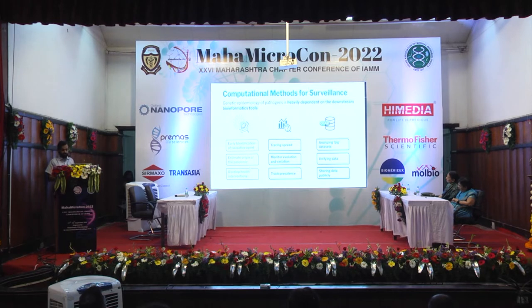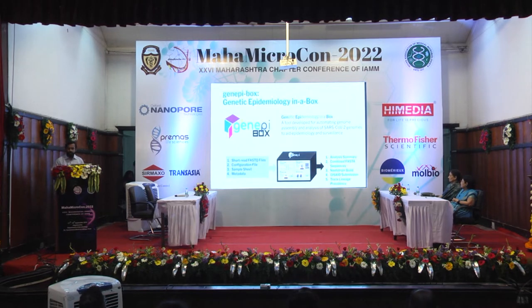But of course, much more important to analyze this further is to be able to share this data so that the public and learned people in the public could actually analyze and make quite favorable interpretations. And to enable this, of course, you need to have computational tools. And this is one of the automated computational tools that was being developed in the lab, where you could use this computational approach or a box where you could use any next generation sequencing data for any viral outbreaks and be able to analyze without having to go to the nuts and bolts of bioinformatics. This is freely available. It can take a FASTA file or a FASTQ file or a GISAID link and be able to analyze this data in a very systematic way and provide reports so that you can make informed decisions.